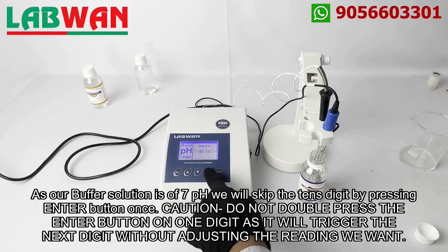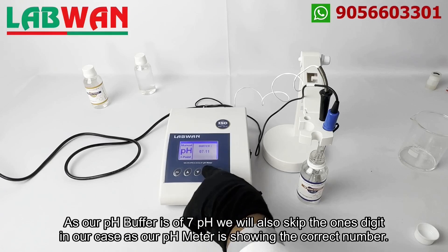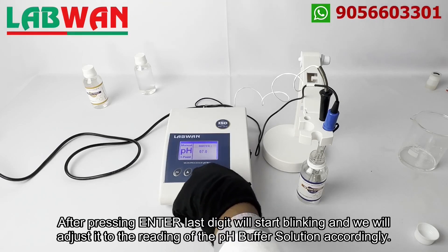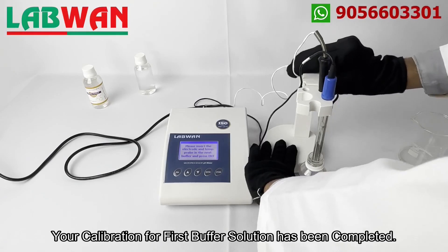As our buffer solution is of 7 pH we will skip the tens digit by pressing the enter button once. Caution: do not double press the enter button on one digit as it will trigger the next digit without adjusting the reading we want. As our pH buffer is of 7 pH we will also skip the ones digit in our case as our pH meter is showing the correct number. Now to adjust the reading to match the pH of our buffer solution we will use the arrow button to adjust the blinking digit and take it to zero. After pressing enter, the last digit will start blinking and we will adjust it to the reading of the pH buffer solution accordingly.